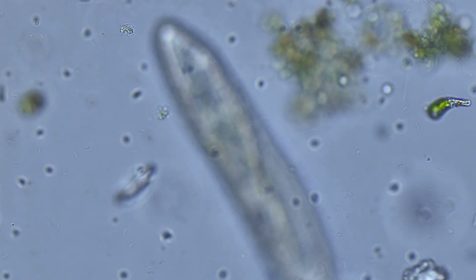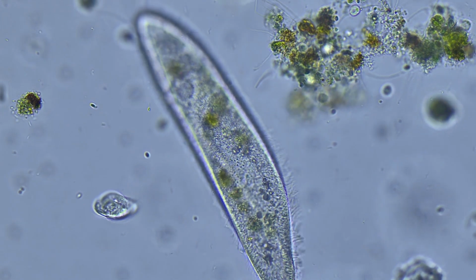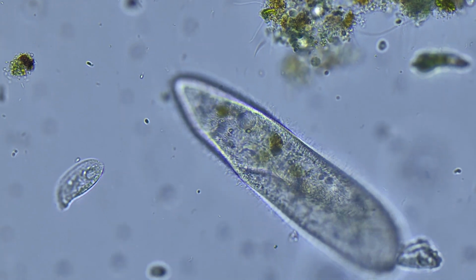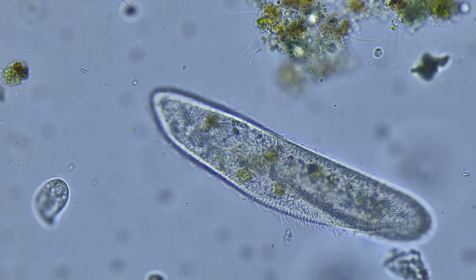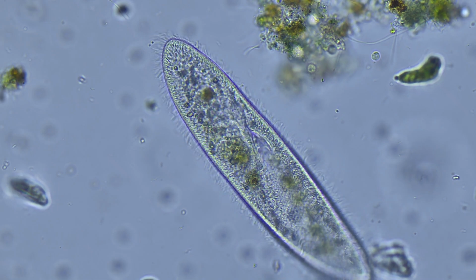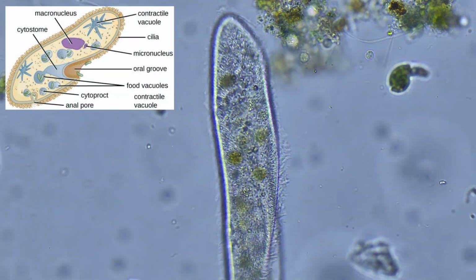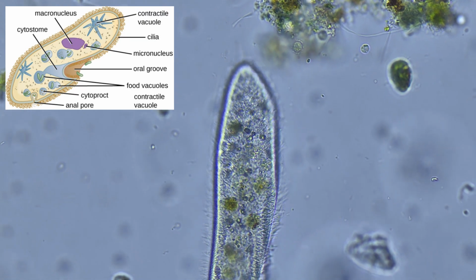This guy, well, the gender technically doesn't apply because Paramecium reproduce asexually and exchange genes through conjugation. Anyway, this specimen is less active, but is spinning so we can appreciate the 3D nature to it. One of the more obvious structures are the hundreds of beating cilia that surround it, which are kind of like tiny feet that allow it to move.